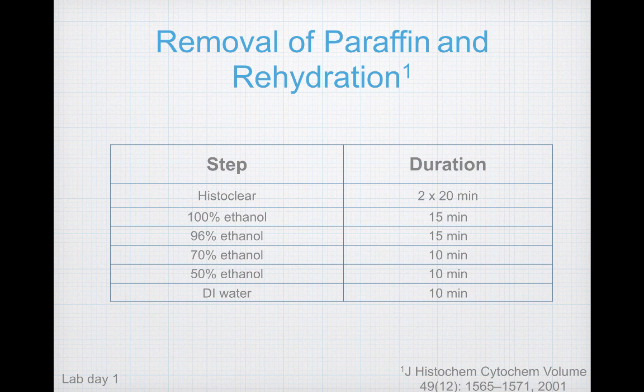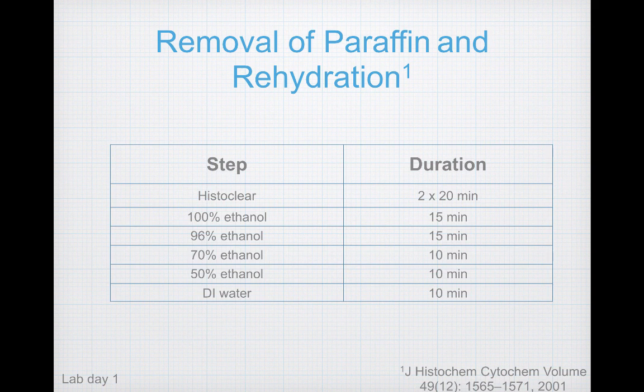Before continuing with staining, you have to first remove the paraffin from the microscope slides. You'll do this by immersing the slides in Coplin jars filled with histoclear, which will dissolve the paraffin wax away — do this twice for 20 minutes each. Then rehydrate your tissue by immersing the slides in graded ethanol solutions, starting with 100% ethanol then 96% ethanol for 15 minutes each, then 70% and 50% for 10 minutes each, and finally immerse the slides in DI water for 10 minutes. All of this is done in the Coplin jars.